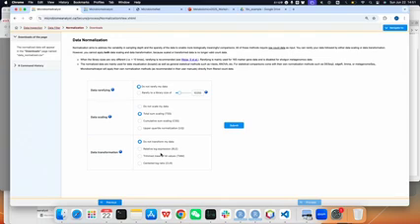because a specific feature of microbiome data is that it has a lot of zeros, and it's compositional, as Dr. Xia mentioned before. So each normalization method has its own assumption, and the default one we use is the most common one. It addresses the library size and removes the effect of the dominant species, and this is more suitable for exploration analysis. So here we just keep the default and submit.